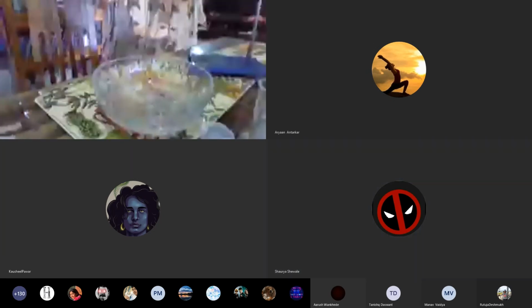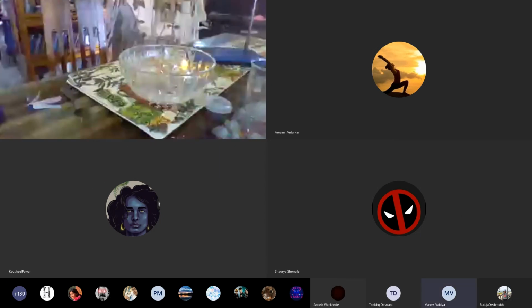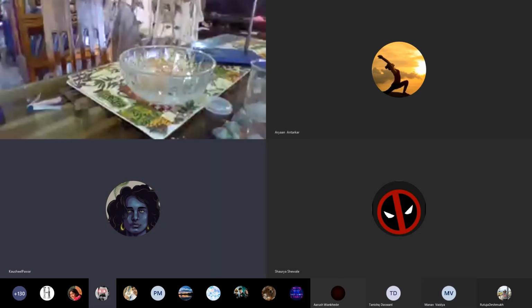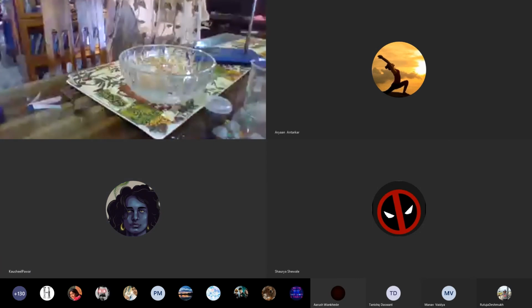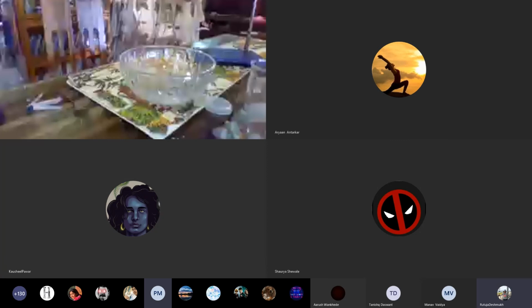Did you see sparkles? Yes, ma'am. Hydrogen gas is being eliminated. Ma'am, I couldn't see. Can you show again?